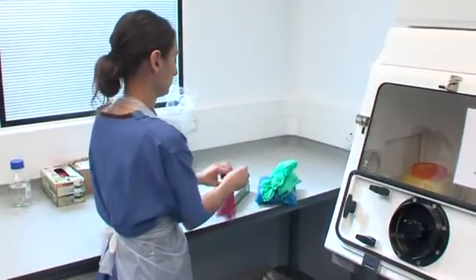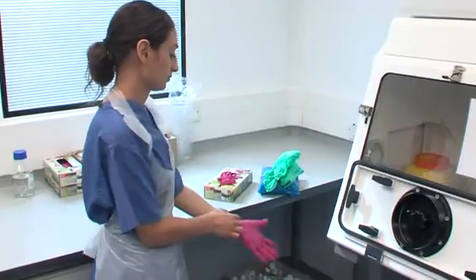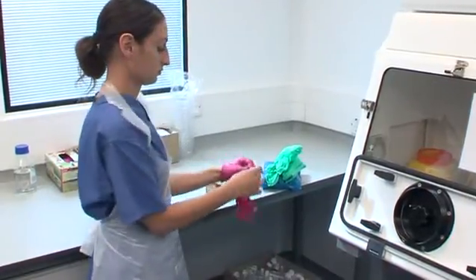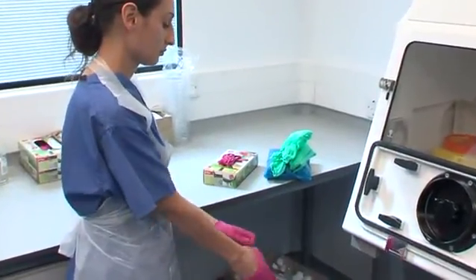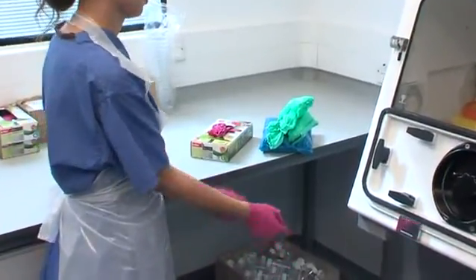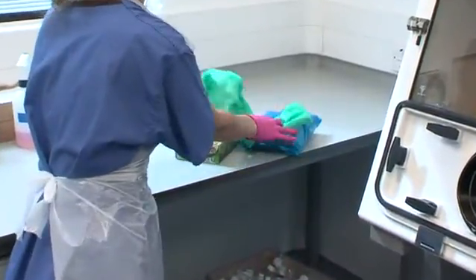The first rule when working with microbiological safety cabinets is to protect yourself from the organism or agent that you are working with. For class 1 and 2 cabinets basic personal protective equipment such as gloves, sleeves and aprons should be used as the operator's arms will be extended into the cabinet.